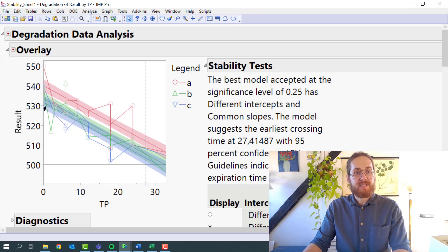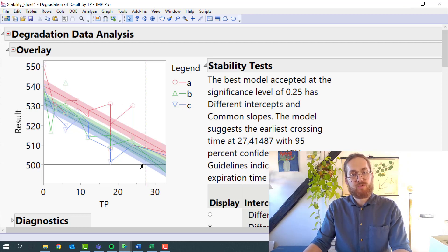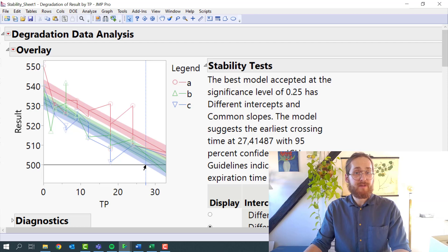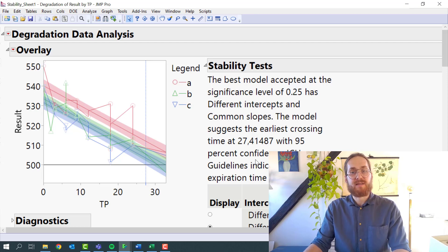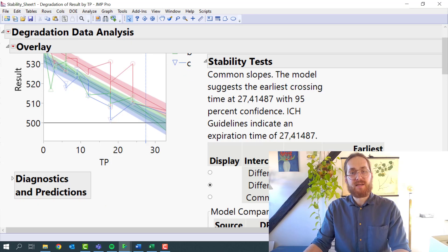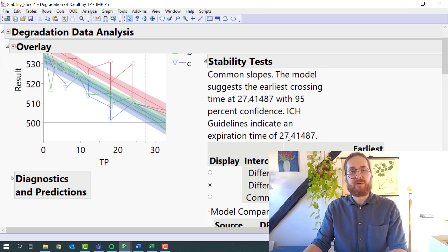And I can see that it is batch C that has the first crossover with my lower specification limit. And that then dictates that this ICH guideline indicates an expiration time of 27.4 months.